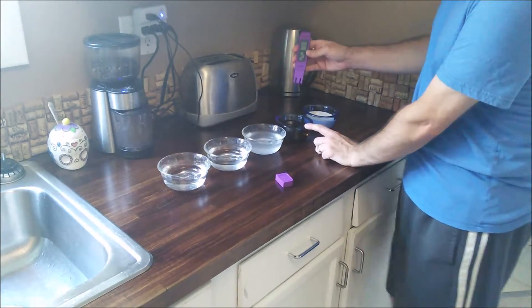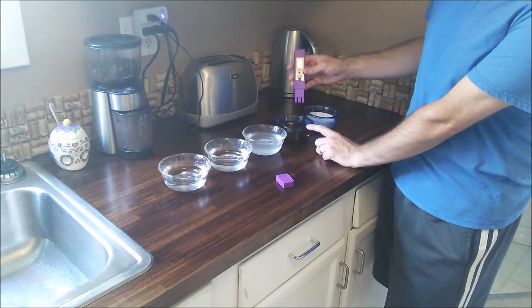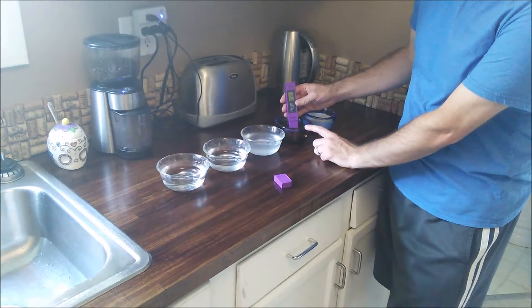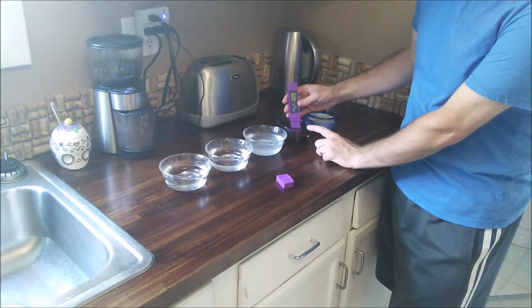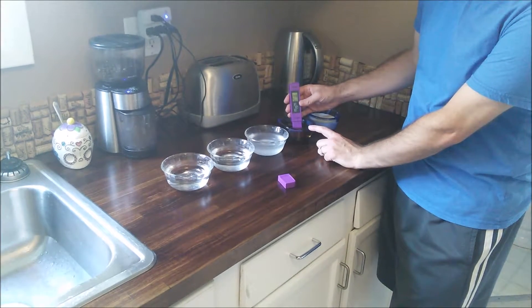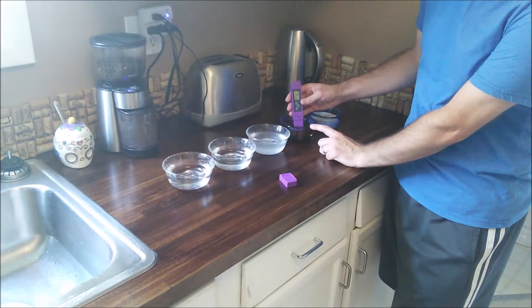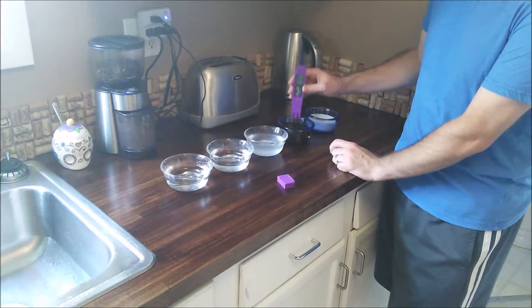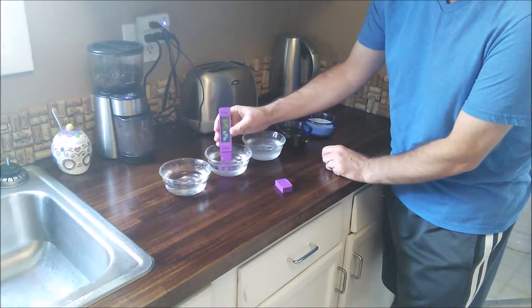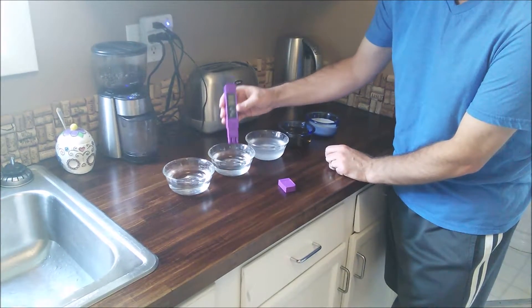The next thing I have — and I'm not totally sure how it's going to read this, it's probably going to be too high again — is apple cider vinegar. Actually, it is reading it. It looks like it's at about 1,700, then 1,600, and it's dropping back down. So it's at about 1,400 parts per million for particles in the apple cider vinegar. I'm going to rinse this off in the filtered water to clean the sensor — and it should zero back out. Back to zero.